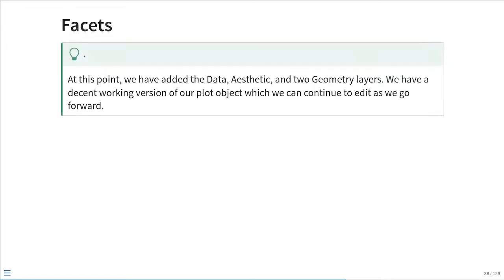All right, at this point, we've looked at the main building blocks for a ggplot. We've looked at the data and the aesthetics, which determine which data is being used. We looked at the geometries and the scales, which dictate what kind of plot and what it looks like. The last bits are more cosmetic, just to flesh out additional things that we would normally do.